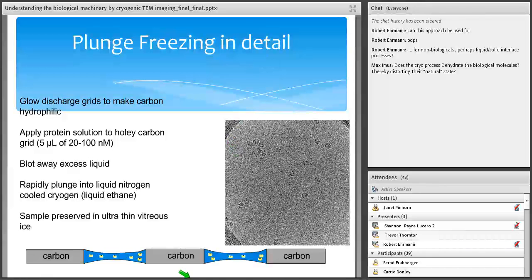What was the big advantage of what Jacques Dubochet did in this process and this method? Well, he worked out a lot of different methods, how to cryosection as well as doing the plunge freeze process. Until he came along, no one really ever tried this, and it was really the technological difficulty of putting something frozen into an electron microscope that was horrifying to most people.